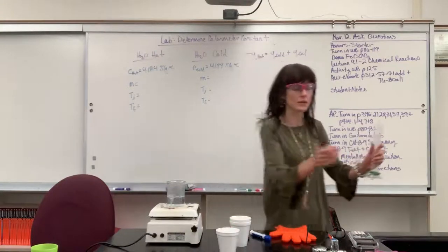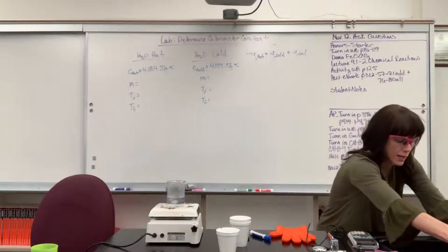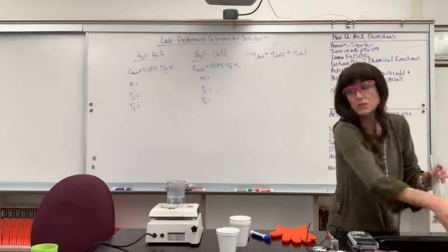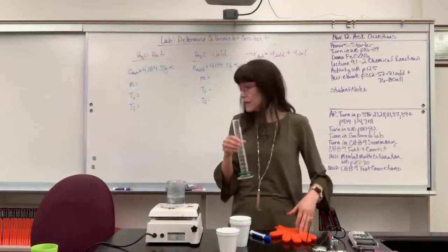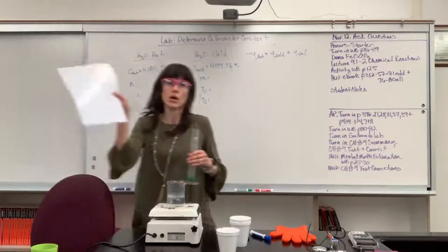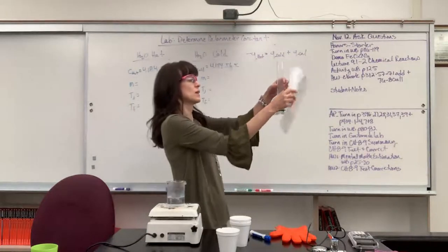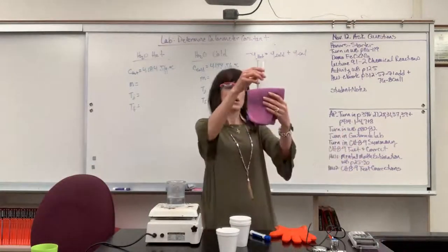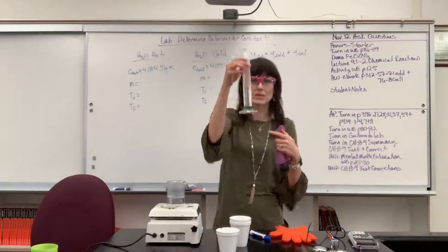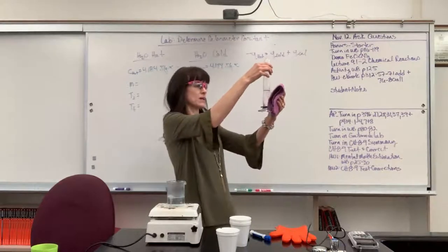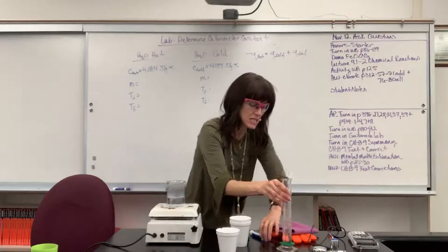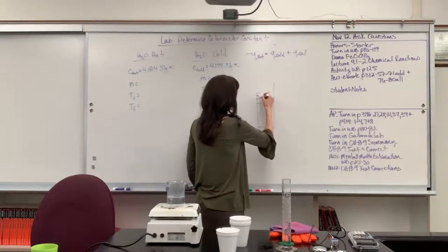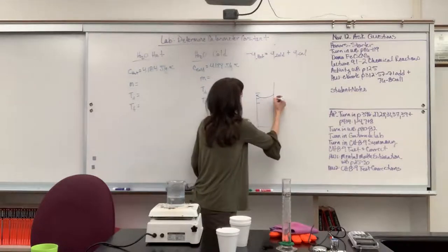Okay. So first thing that we're going to do is get the cold water. And I'm just going to use regular tap water. You know, it might be slight OCD habits. I like to use 50 mils. I try and do 50 mils really, really close of each of the hot and the cold water. And then a good practice is I like to take a white piece of paper and put it behind. So I'm reading. And sometimes it can make it a little bit easier. Or if I go like this, it can be a little bit easier. Sometimes I'll use colored paper if I'm having a hard time reading it. And that helps it stand out. So I know you can put something behind your graduated cylinder to read it. So I'll use my pink cloth here. And we are at, so remember, I'm reading the meniscus. You always read the lowest part of that graduated cylinder.